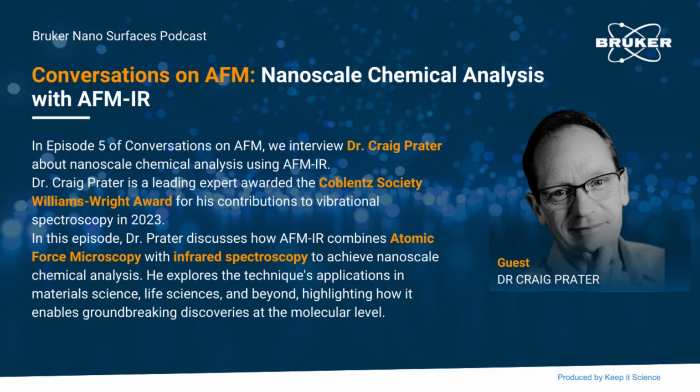Sure. So as you mentioned, AFM-IR is a combination of two well-established techniques, atomic force microscopy and infrared spectroscopy. And backing up a little bit, I want to talk about the motivation of AFM-IR, and then I'll talk about how it works.